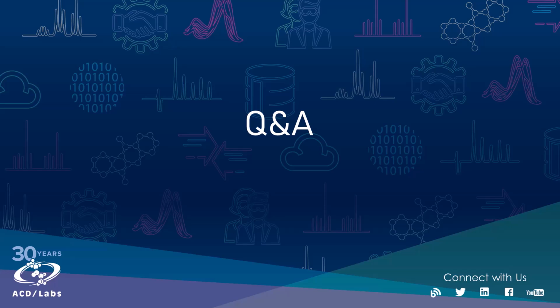Generally what we do is you send a little bit of data our way, just maybe of some standards, and we would create an example training project for you. And then the application scientist would go through that with you. So we get the data up front just so that we can start it, and then we work through the rest of it with you live.